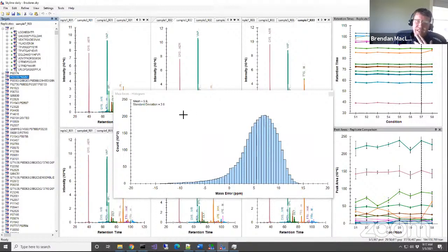So here we can wish that Skyline, I promise, in the future will have the ability, and hopefully do it automatically itself, to adjust the mass error to this mean value. That explains why the score wasn't any good: all the good targets are centered around something that's not 0. In order for it to be useful as a peak score, they really should be centered around 0.